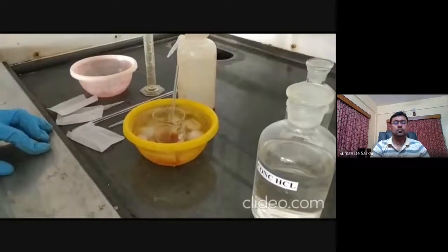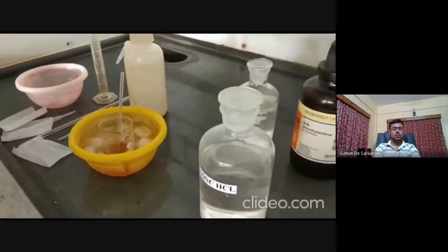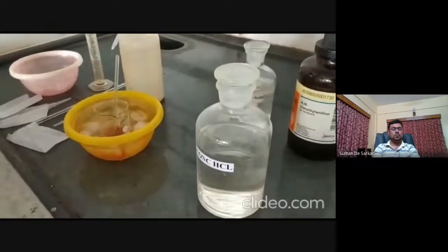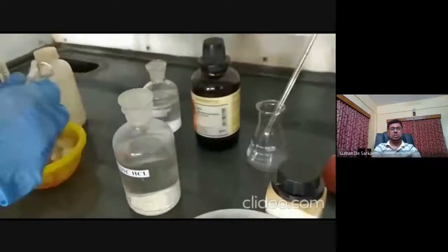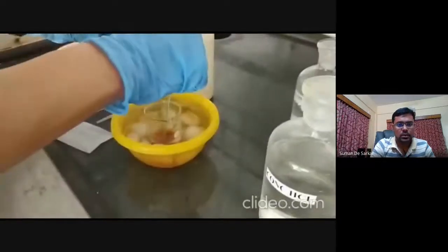With this solution, now we will add the cool N,N-dimethyl aniline solution in acetic acid. Now, this diazotization is a pretty fast reaction. It finishes within a minute. So it's ready now. We're adding the other coupling partner.